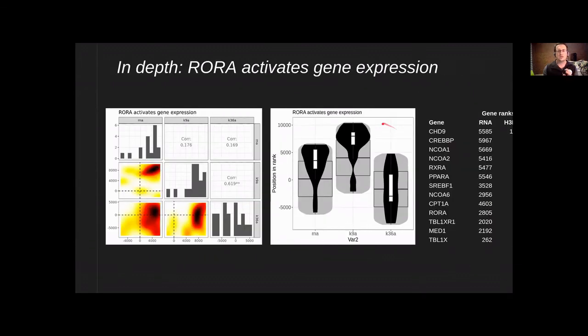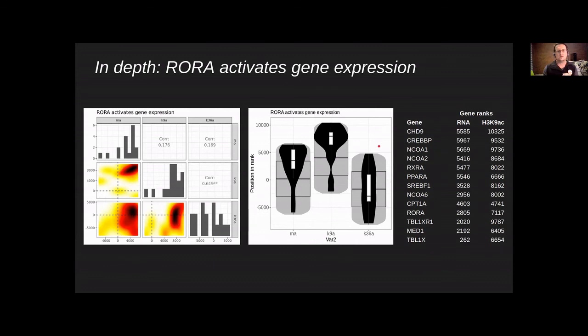Naturally, everyone wants to dig in a little bit deeper and see which of the genes are driving this enrichment. So Mitch provides the list of genes and their relative ranks in that omics data, so you can design primers and follow it up with specific experiments.